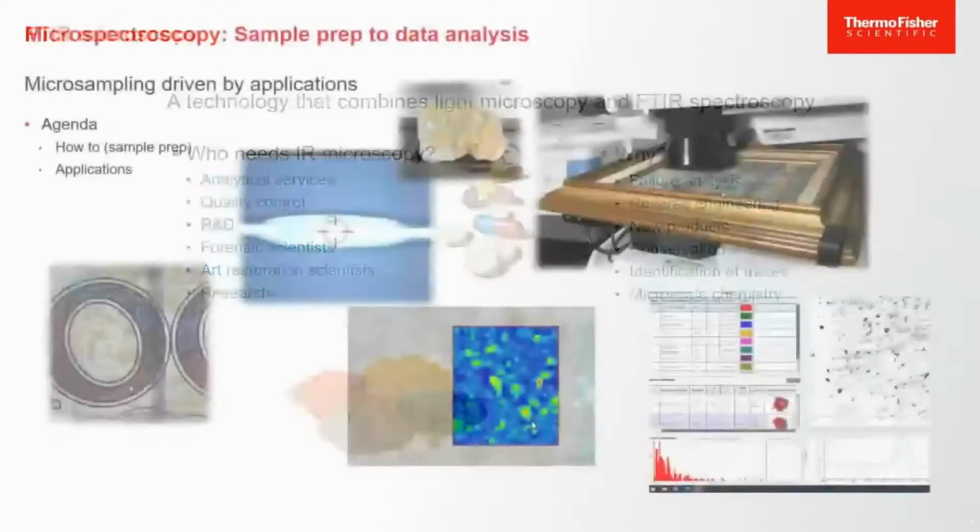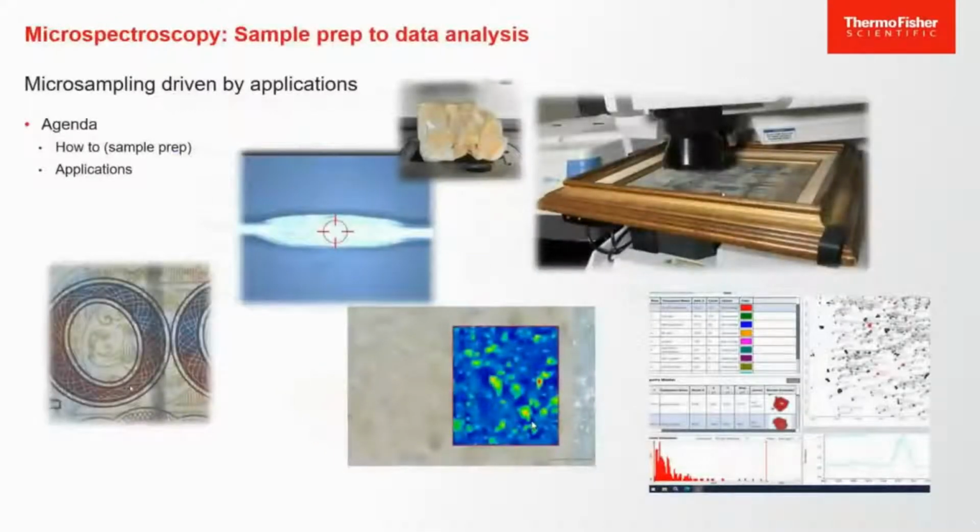As I said at the outset, there will be two parts to this. The first will be how-to, because sometimes sample prep and the choice of the different sampling techniques may be the most difficult part of the whole analysis. And then we'll look at some applications. As you look through this slide, we will see most of these in the presentation.